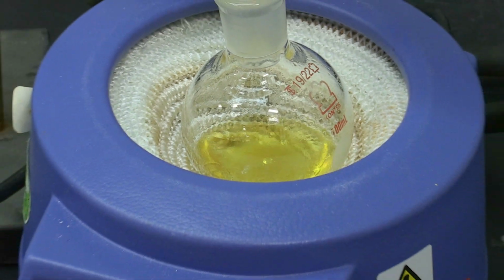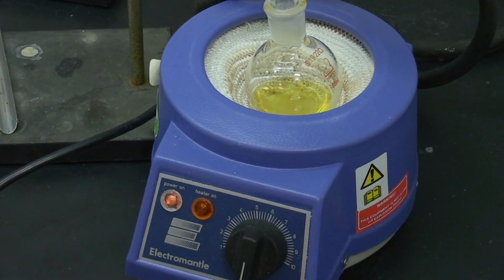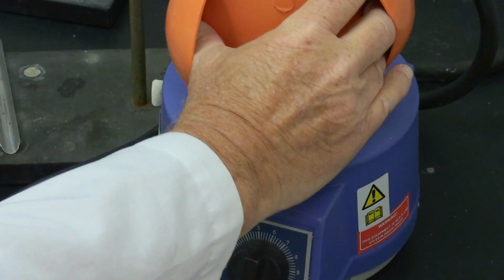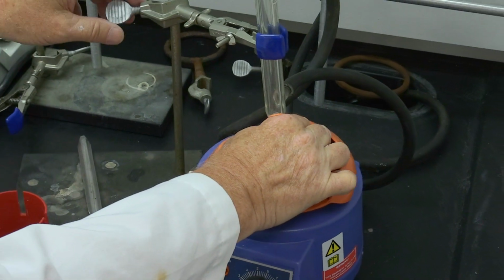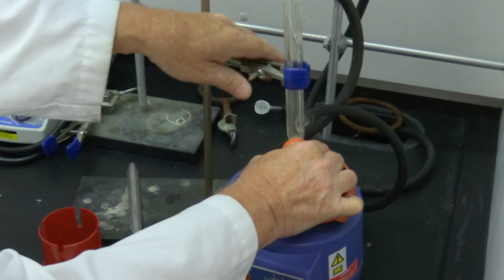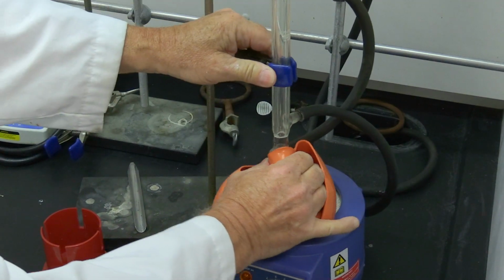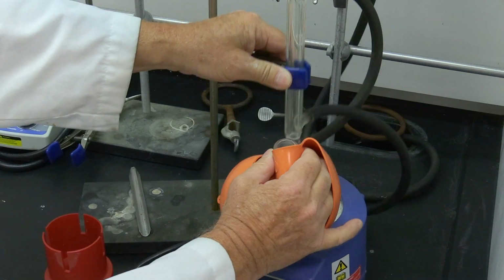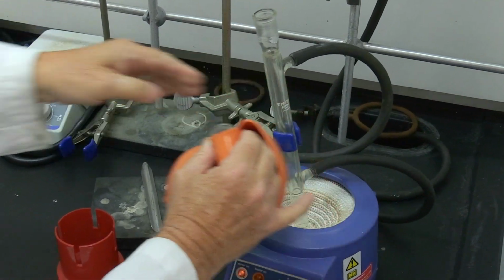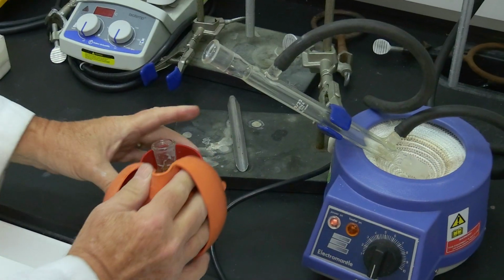Okay, now we've reached our 60-minute time for the reaction. We'll turn off our heat. Let this cool for a minute. There we go. We'll just let it cool.